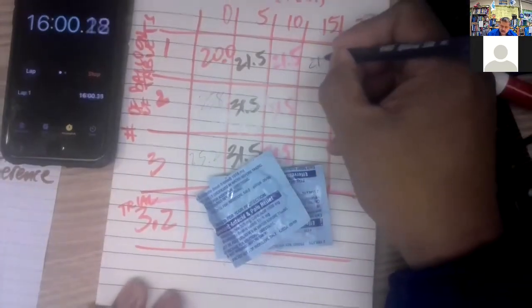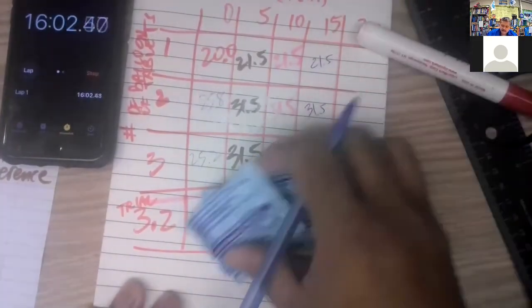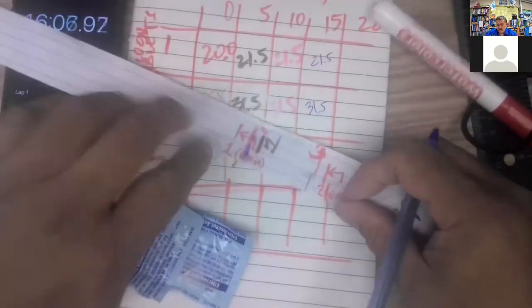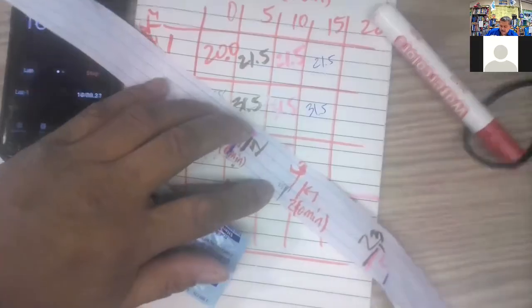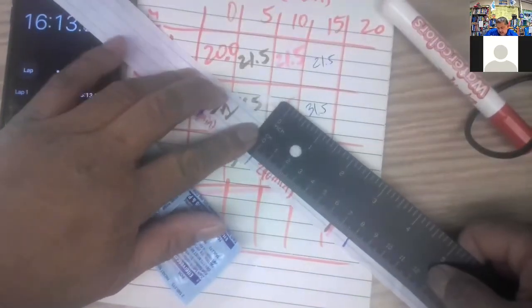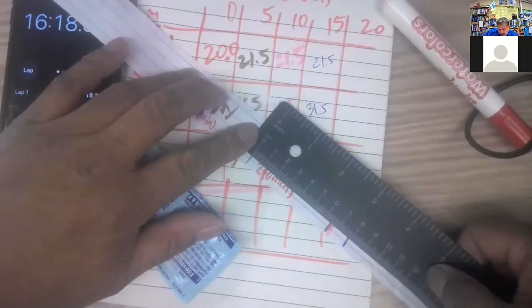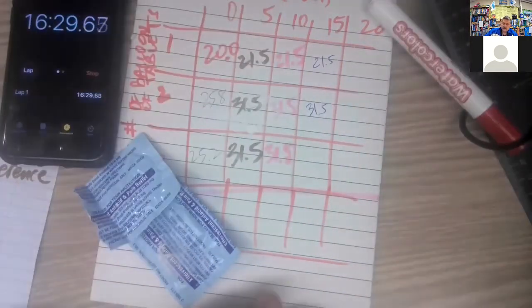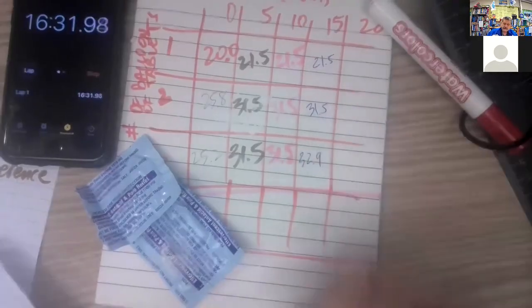So this one's 21.5, 31.5, and then this is our new one. So remember my pencil line there is 25. So I'm going to add to 25, 7.9. So what is that? 32.9. Right? 32.9. Right.